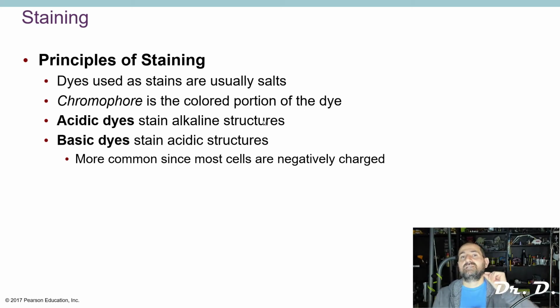If you have a positively charged dye, it will stick to negatively charged specimens. This is really important to understand. Now look at this: most cells are negatively charged. Have you ever heard of membrane potential? I think we talked a little bit about membrane potential.